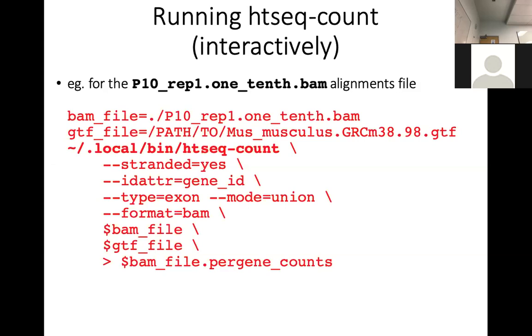And how big is this file? ls -l. I'm not sure why it needed 10 minutes to realize that it didn't have any data to work on, but yeah, it just crashed. You need to fill in the file name. So the file that gzip is trying to read is your FASTQ file.